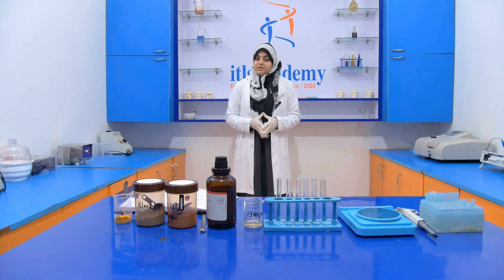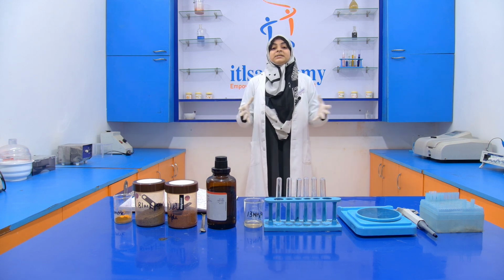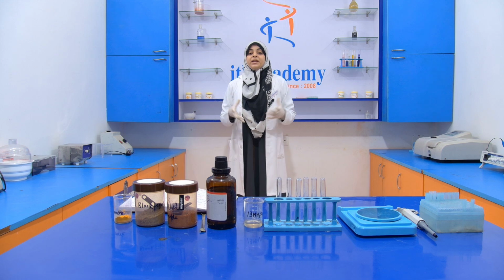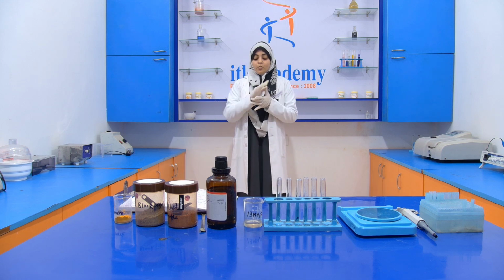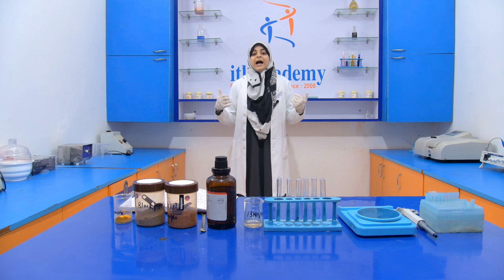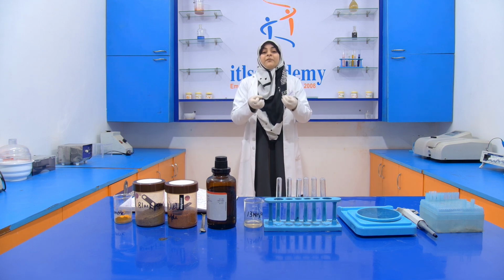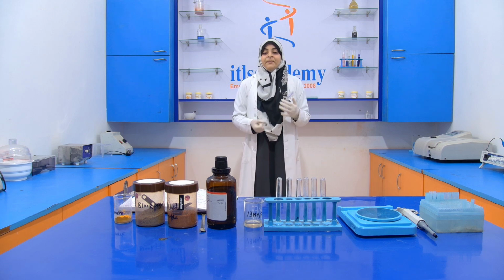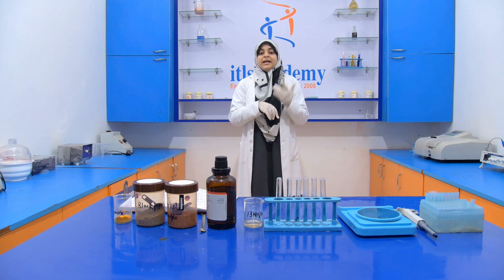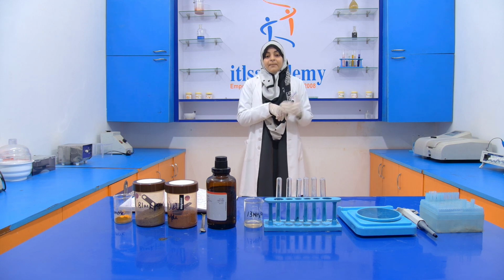We dilute the concentrated sulfuric acid. When we are handling concentrated acids, we have to take extra care. We have to wear a mask, gloves and a lab coat so that even a drop of the concentrated acid should not fall on us. If it falls on our skin, it burns our skin and causes irritation and damage.